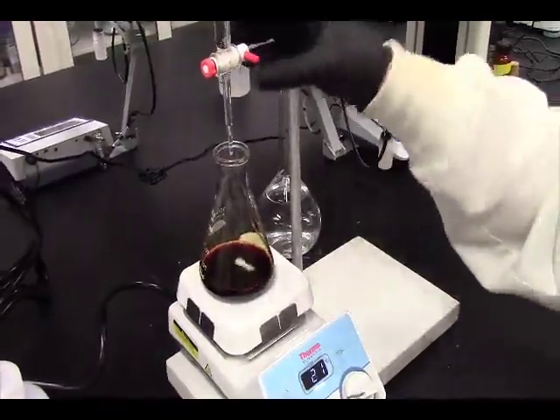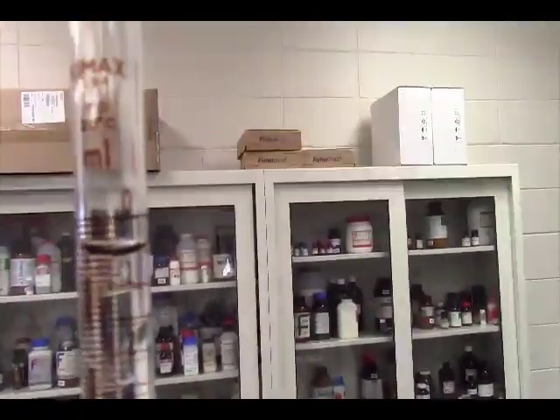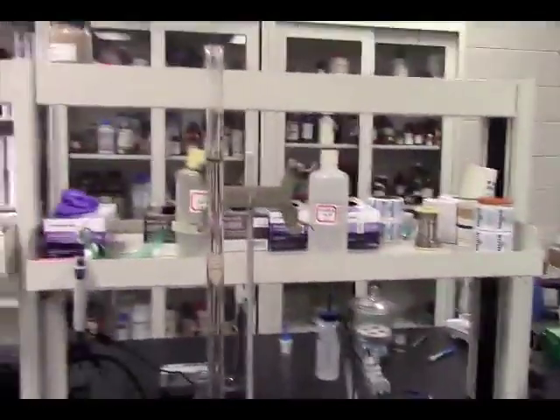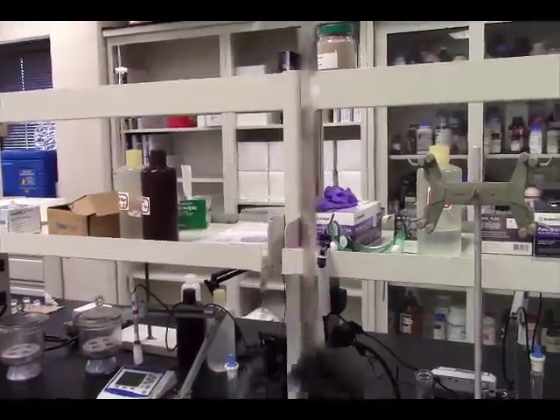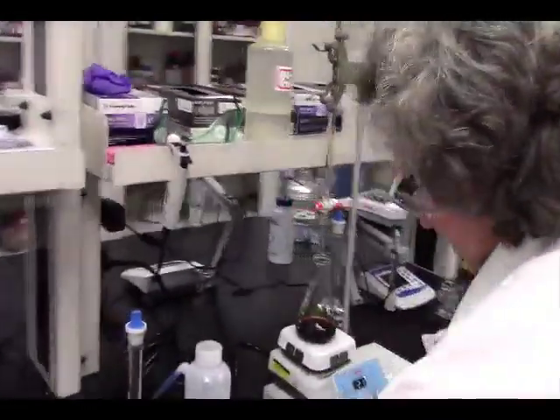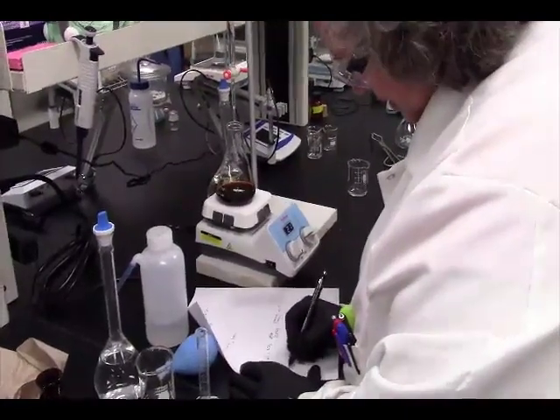Going to set this up for titration. Starting, we need to read our volume. Our initial volume is 0.61. So let's write that down. Example one, initial, final, 0.61.